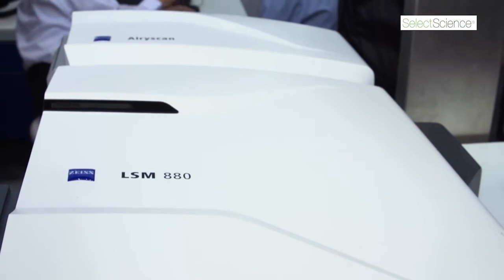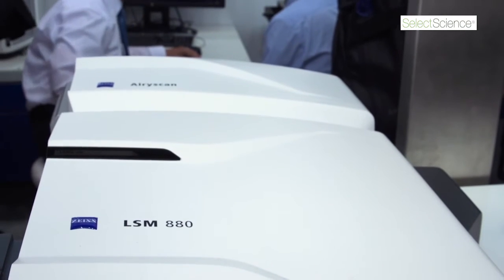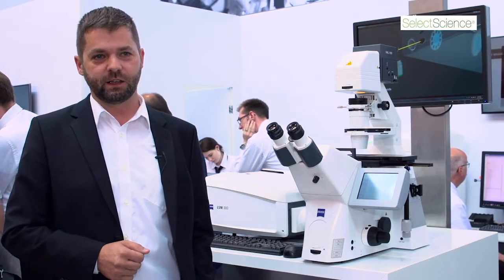At the back we see the new AirScan Detector — the area detector that allows high resolution and fast imaging. The LSM 880 is a very flexible scan head, so it can be expanded with many different laser lines.